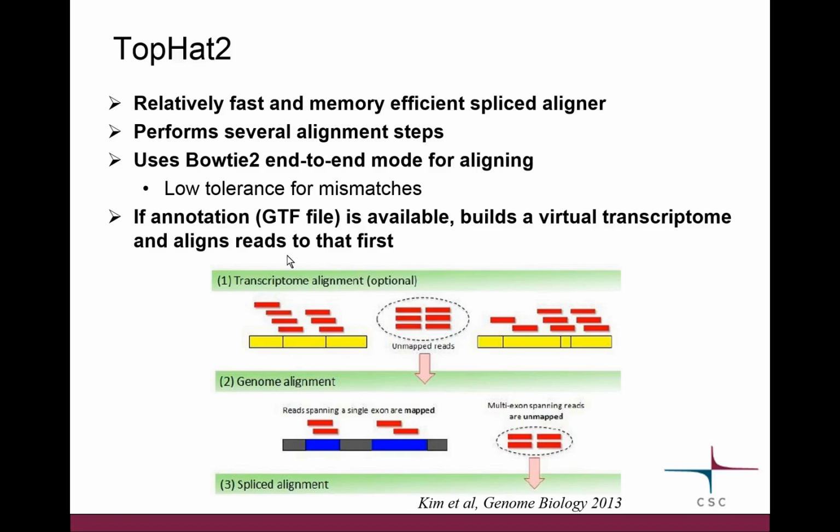And so then, very quickly, we can go through the steps of TopHat while your TopHat run is running.